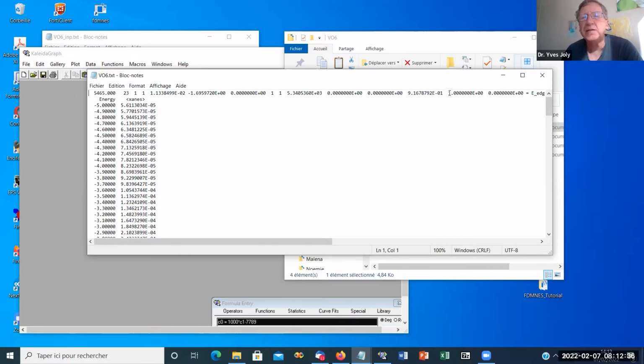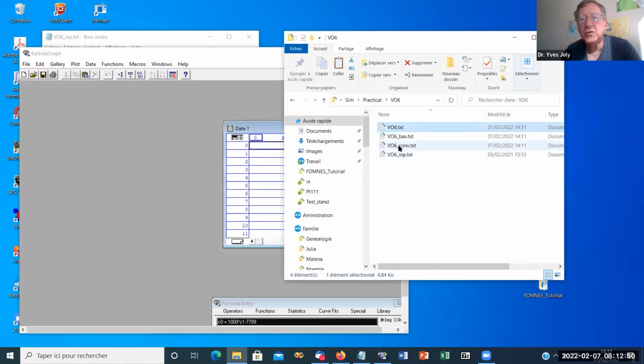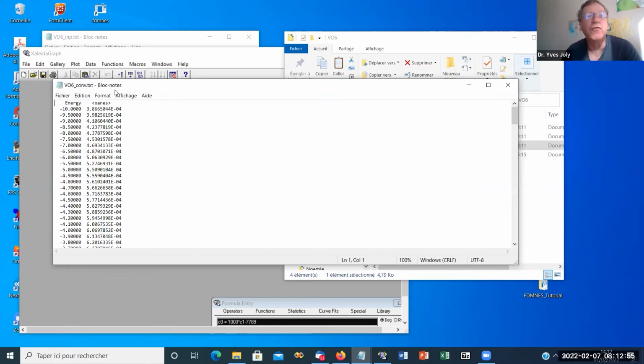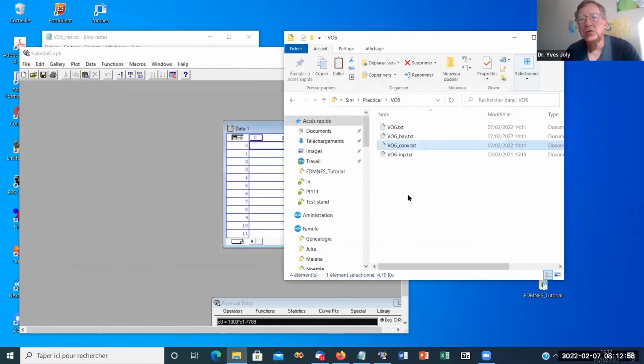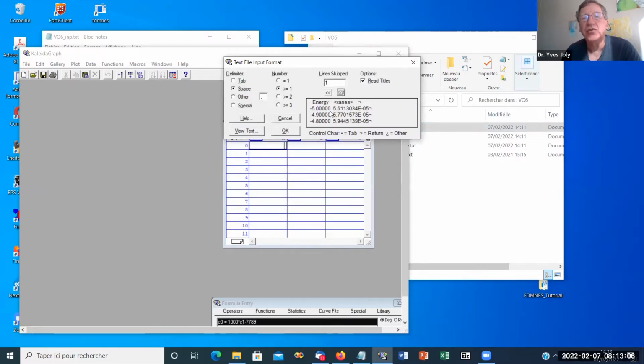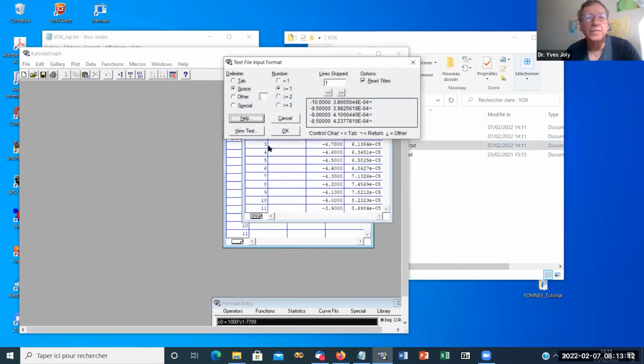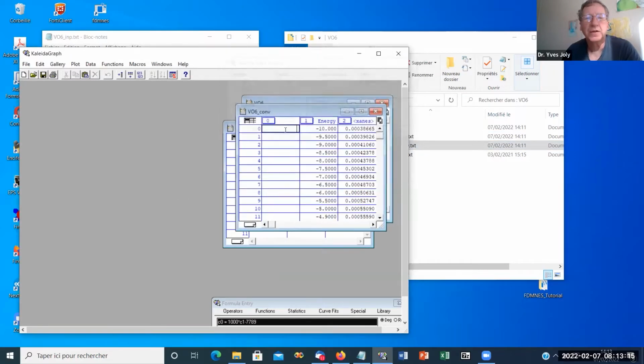Here there is a specific line necessary for the convolution part. So when you plot, you have to consider it. You have to eliminate it in some way, but for the convolution you need it. The one which is convoluted has this underscore conv, so it's the same but without the first line. And the BAF file we'll see after. So I plot this one, the non-convoluted one, skipping the first line. And I also plot the convoluted one, where I don't skip.